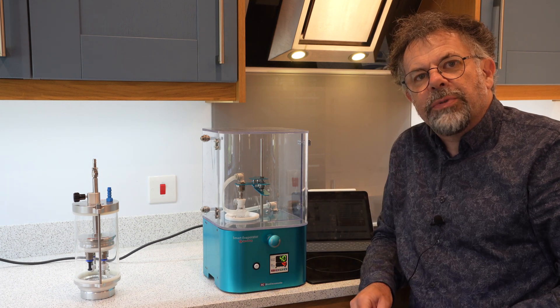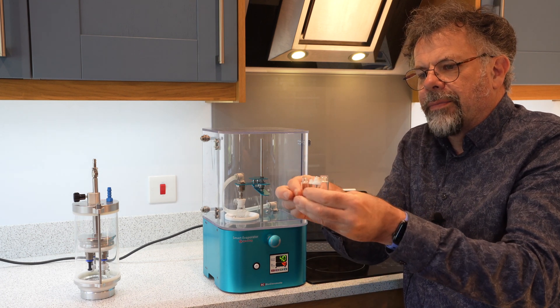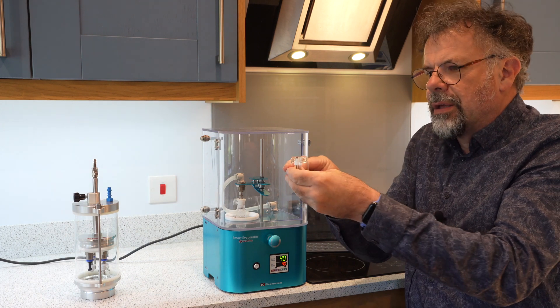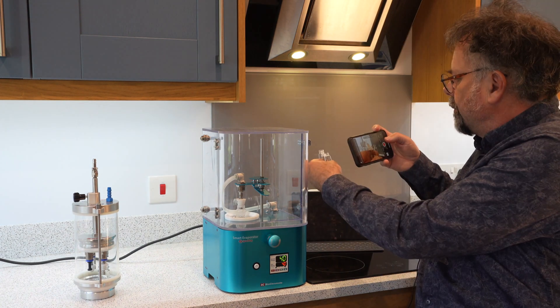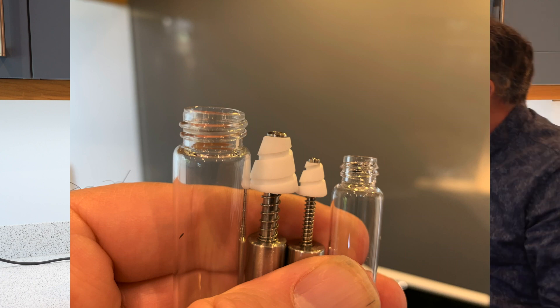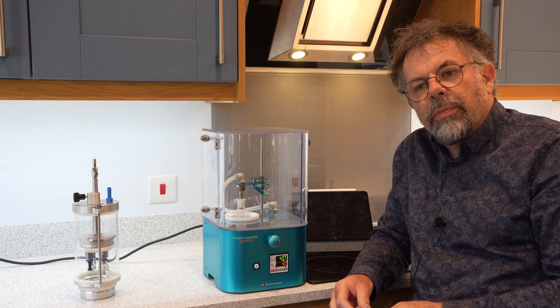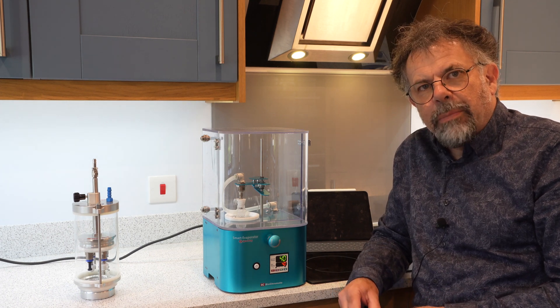Depending on the tube size you have, there are different sizes of spiral plug. Different sizes of spiral plug allow you to choose pretty much any size of tube for evaporation.